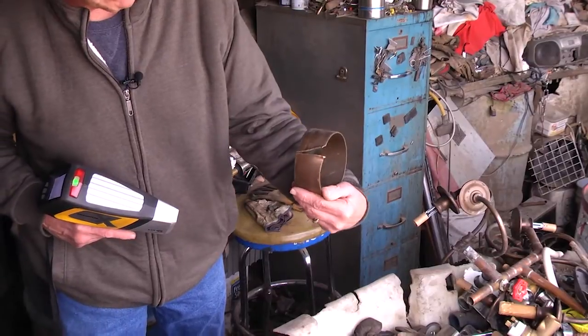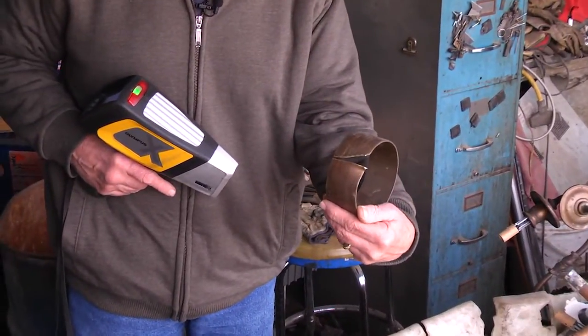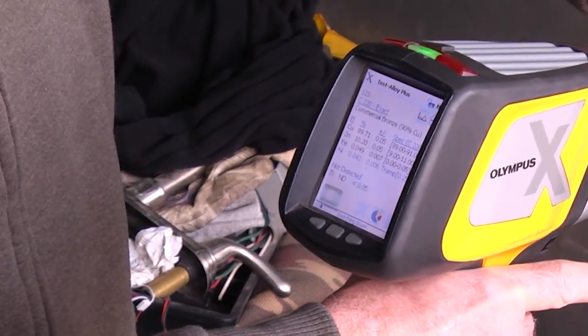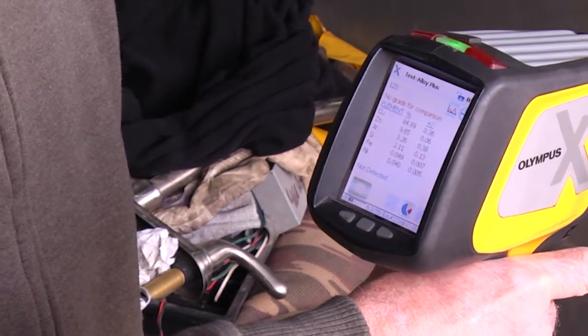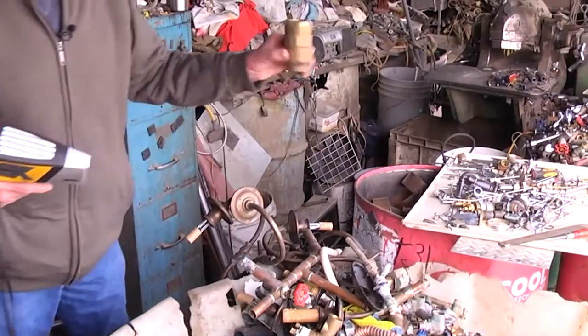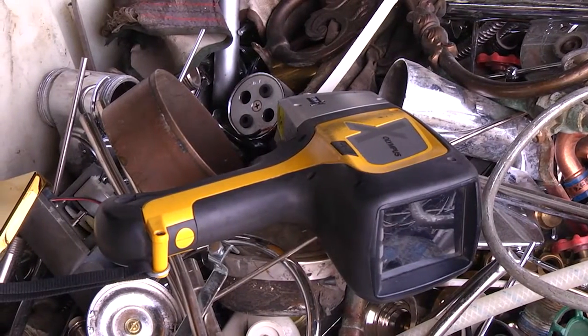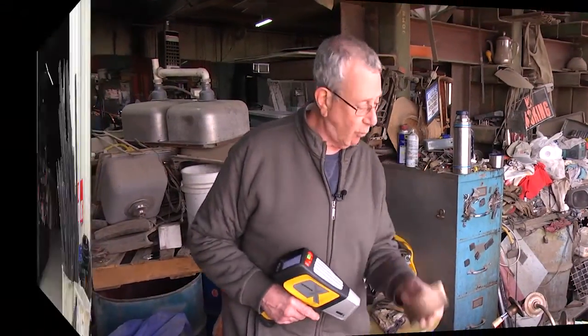Looking at something like this that's been cut, I would have initially thought it was maybe a yellow brass alloy, but it's coming up with an alloy of C220, which is a bronze — meaning it's better than a yellow brass. Yellow brass is going to be 65% copper; this reflected 84%, which means it can go to a red brass, consequently reaping a better reward for it.